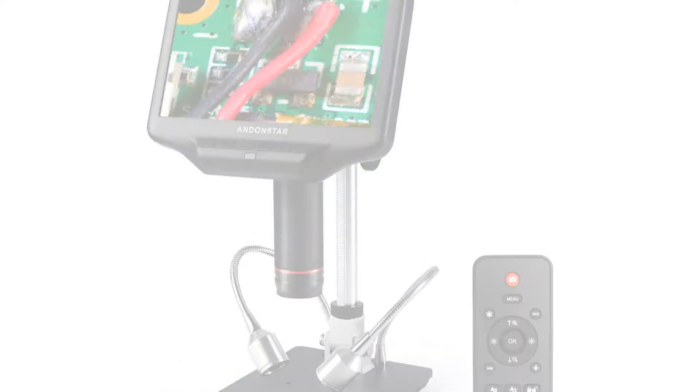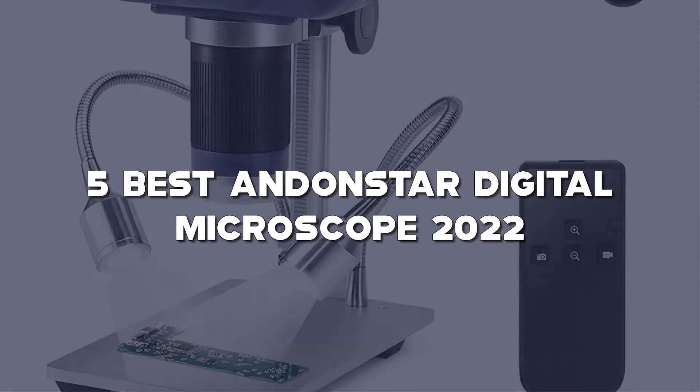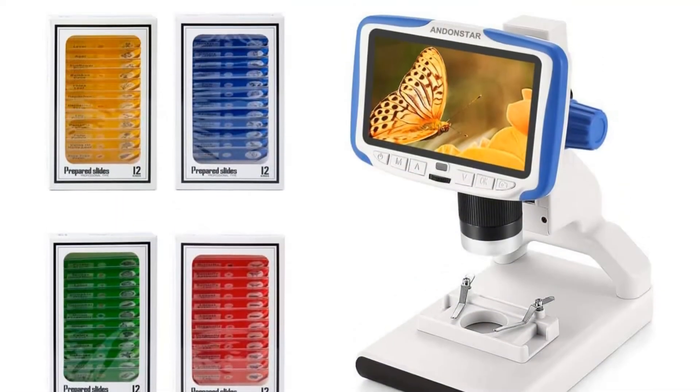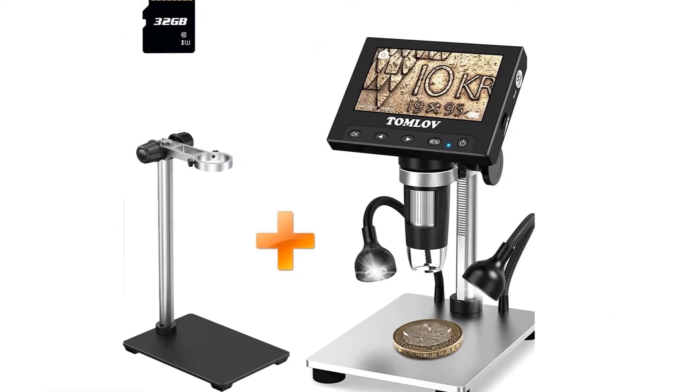Today I have come up with a list of the top 5 best Andonstar digital microscopes of 2022 on Amazon that are worth buying. So let's get started.